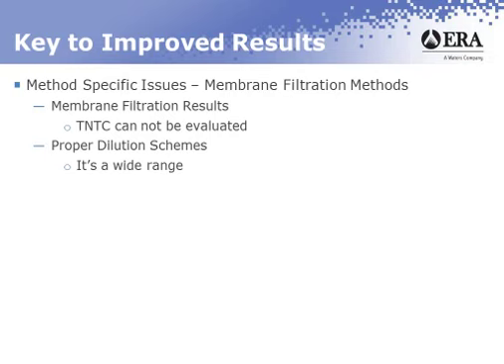What we would recommend is that you run the entire volume of the sample in portions to cover that range. And of course, the sum volume of all of those should be equal to the total volume of the sample that's provided. That should generally give you a result on one of those plates that falls within your ideal count range, and then you just need to make the adjustment based on which plate you selected.